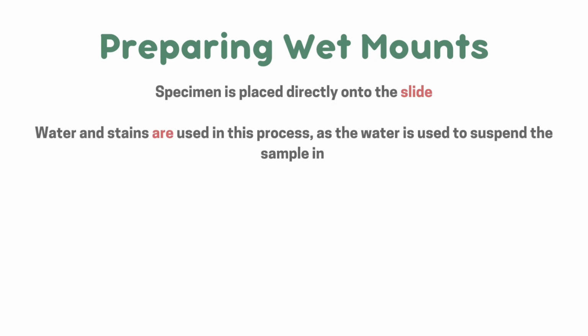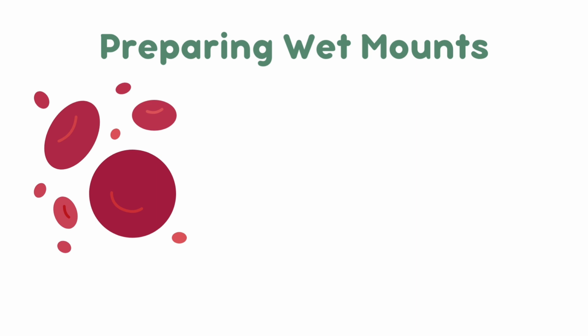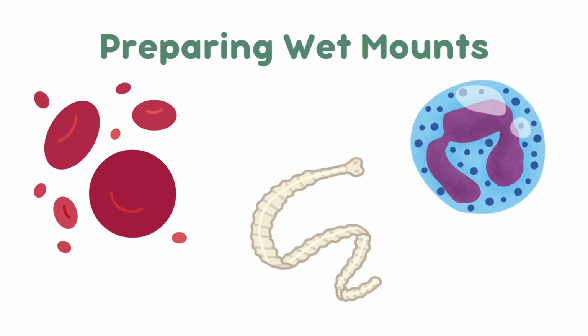And now on to preparing wet mounts. Here the specimen is placed directly on the slide. Water and stains are used in this process, as water is used to suspend the sample in. The specimen is not normally cut in this process. Then the cover slip is added to the slide at an angle to prevent air bubbles forming from the water droplet added. Wet mounting is usually carried out for samples of red blood cells, white blood cells, or even parasites.